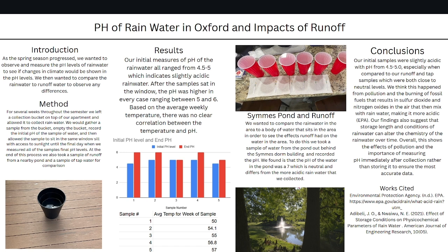And then on the final day, we measured the final pHs for all the samples that we took. On the last day is when we also took our final sample from the Sims pond and we measured the pH of that too. So I'm going to pass it off to Adam to look at our results.